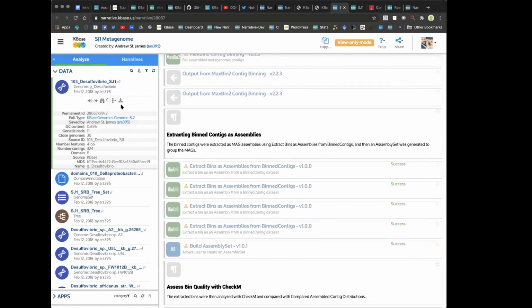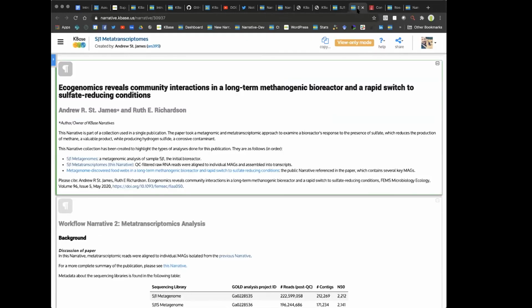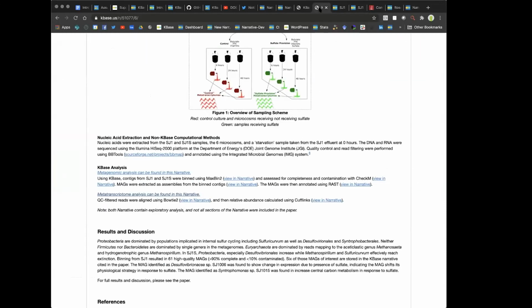Well, I don't know why that's struggling right now, but we're seeing users take these various features and make something useful for them out of it. This is just a creative way that we've seen users combining both static narratives and public narratives to share their science with the world. So a lot of exciting examples, and we're seeing more and more examples like this every day.